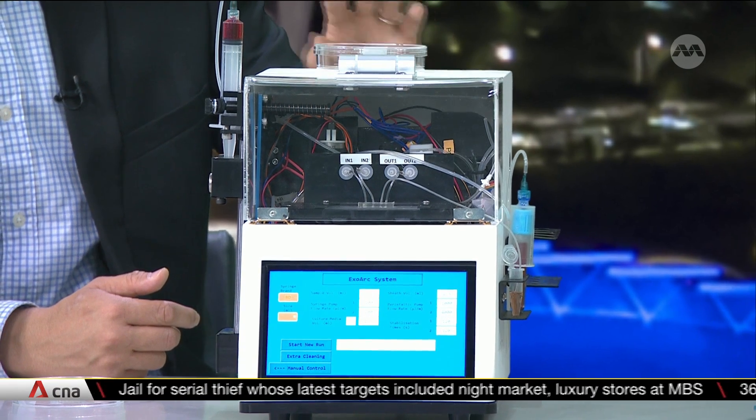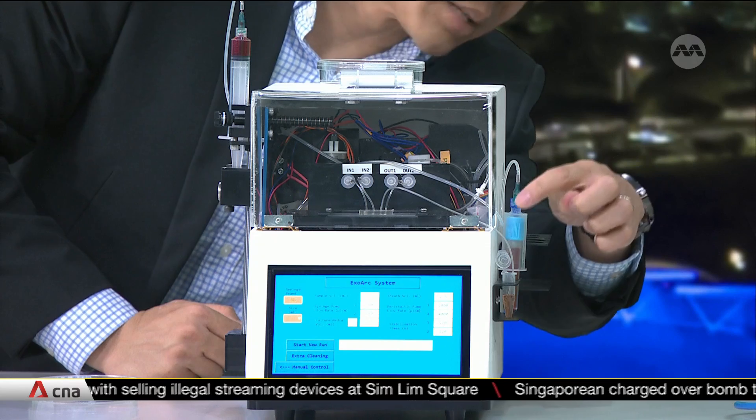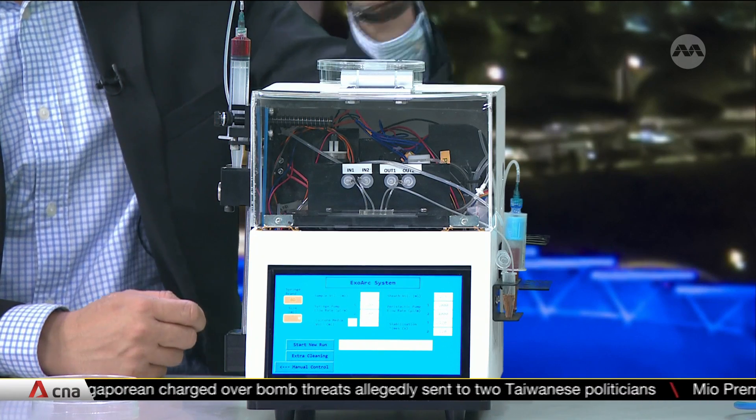With this EXOARC device, it separates out the plasma from the blood in a very quick and efficient manner. As the blood continuously flows into the device, the plasma will come off and be collected in this small little tube, as shown here. Once this process is completed, the plasma can then be used for downstream analysis. It's automated, it reduces a lot of manual steps, and this is why we can speed up blood sample preparation — processing about a tube of blood takes about 30 minutes.